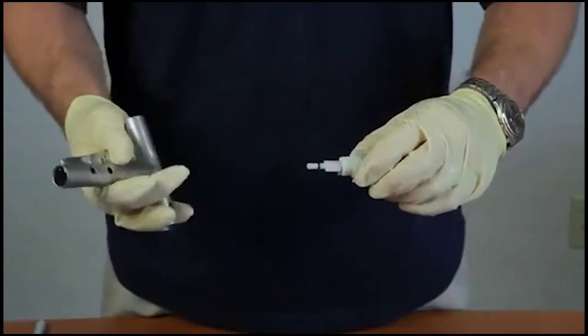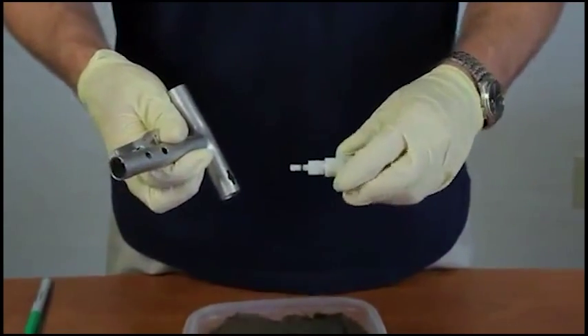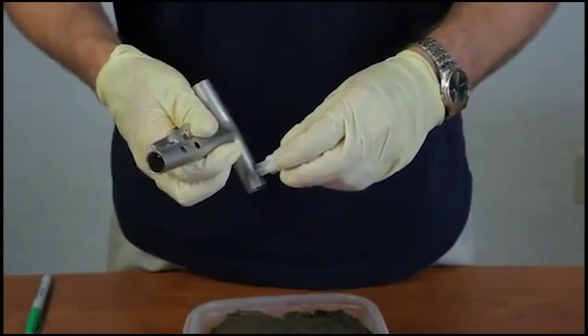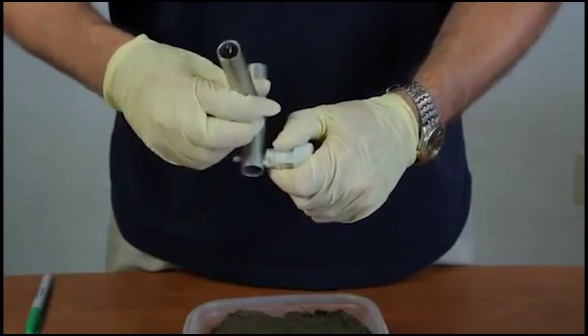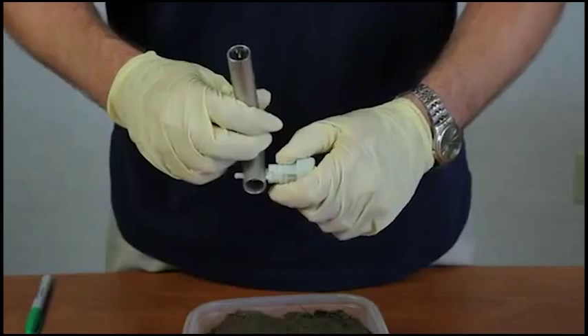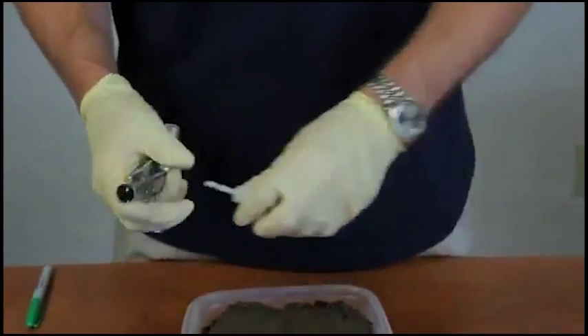Remove the sampler. There are grooves in the T-handle right here. The sampler plunger goes on there, and then you give it a quarter turn twist to lock the plunger to help the sealing of the sampler.